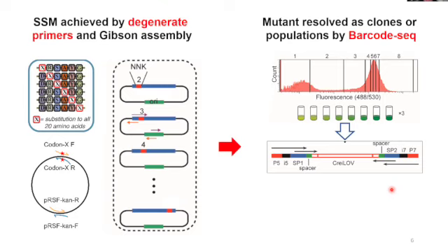One way to do it is to do it in a pooled format. So we put them together and use assays to link the mutational impact to a fluorescence readout. There we can use FACS to separate them into different bins, then use sequencing technology to add barcodes to the different bins, put them together, and use next-gen sequencing to separate them out. This can equally be applied where the phenotypes can be linked to growth fitness.